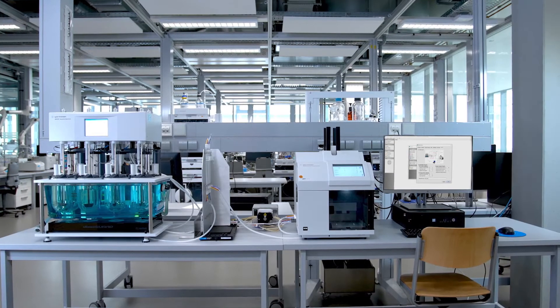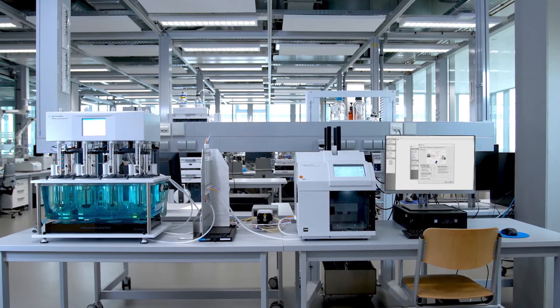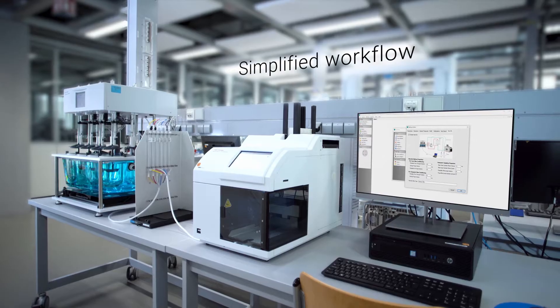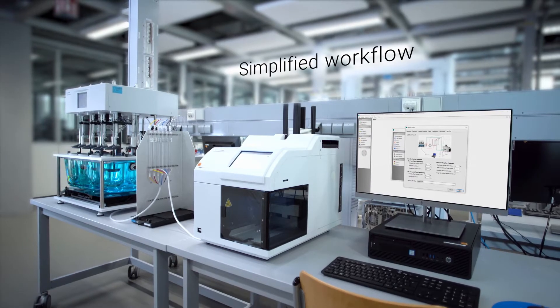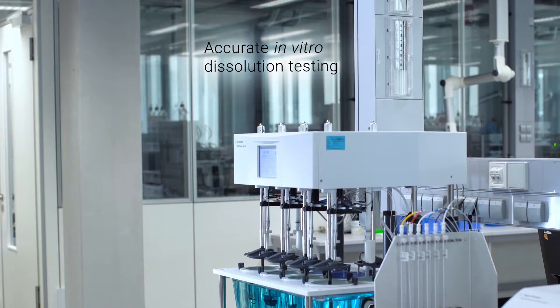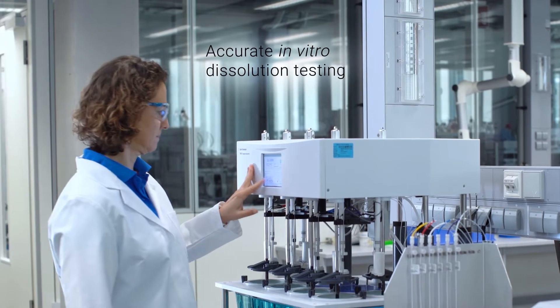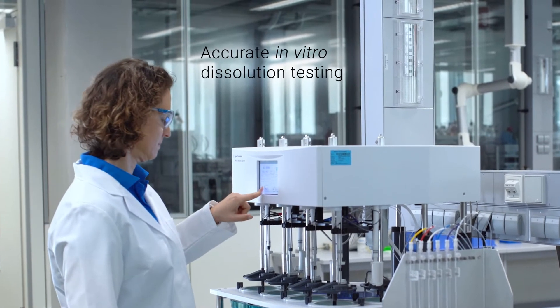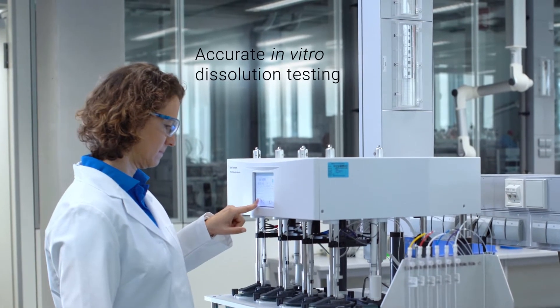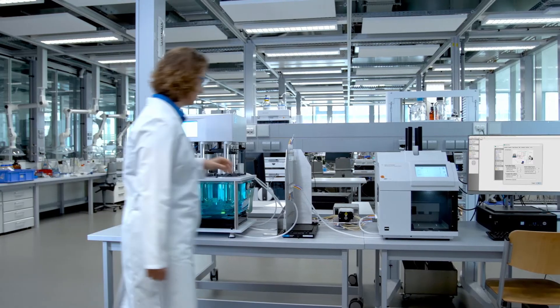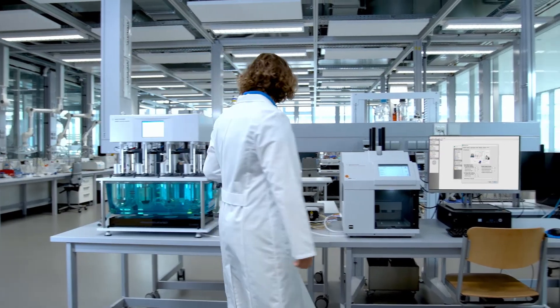The Agilent NanoDisc system can help you simplify nanoparticle dissolution testing by providing an automated workflow to perform accurate in vitro dissolution testing.